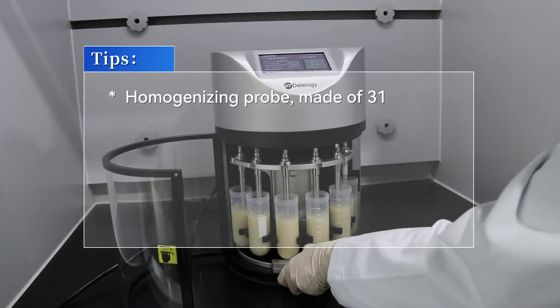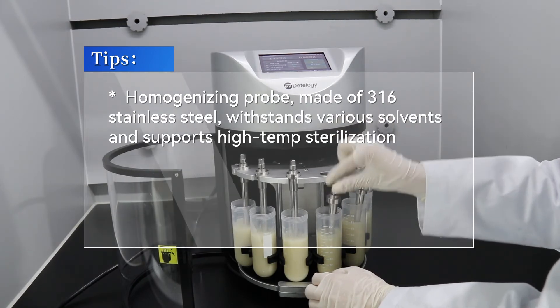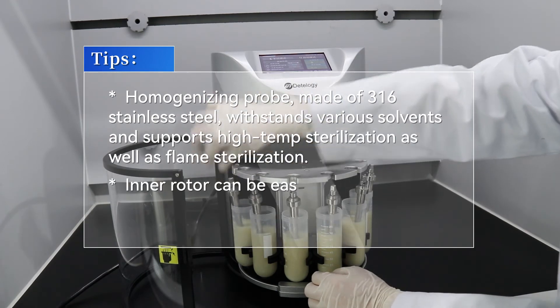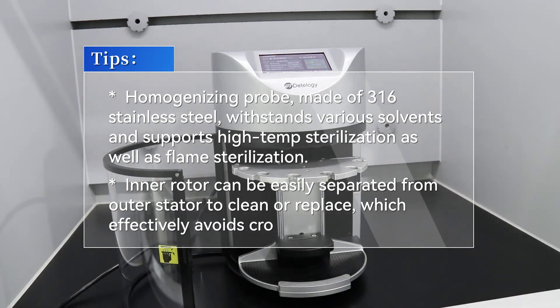The homogenizing probe is made of 316 stainless steel, withstands various solvents, and supports high-temperature sterilization as well as flame sterilization. The inner rotor can be easily separated from the outer stator for cleaning or replacement, which effectively avoids cross-contamination.